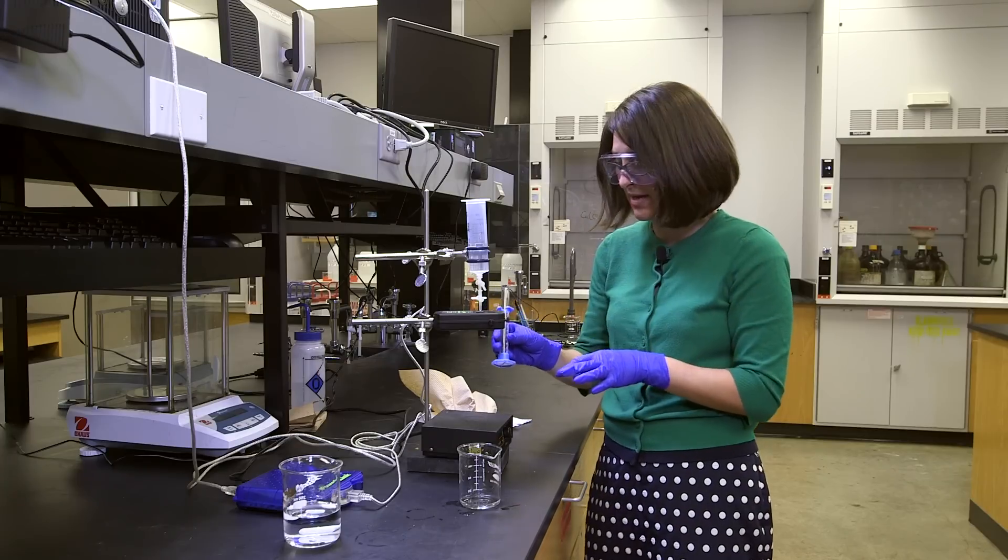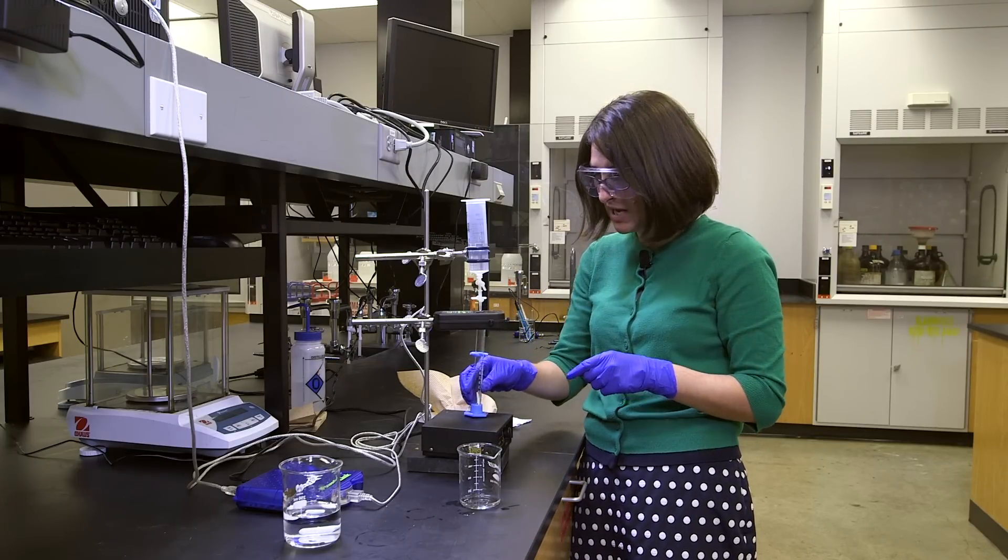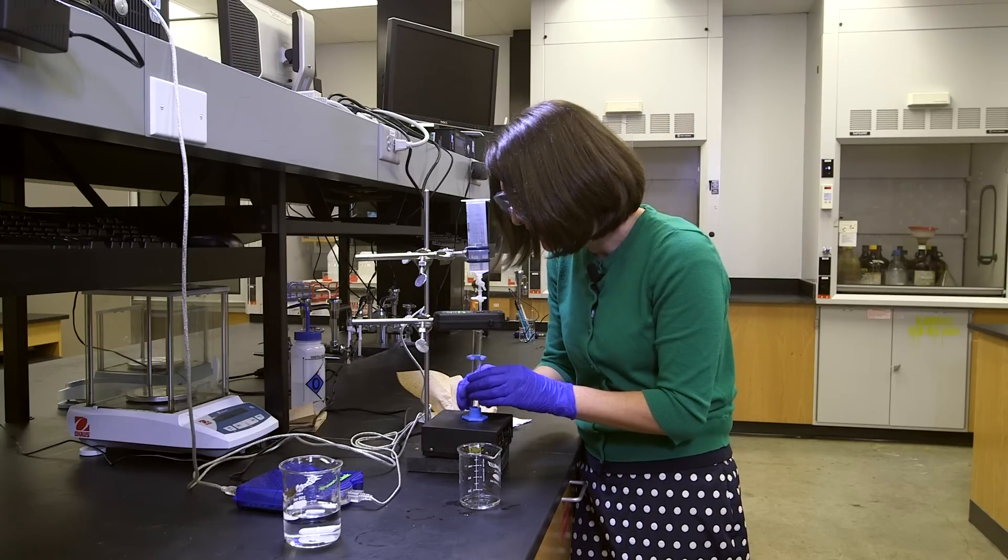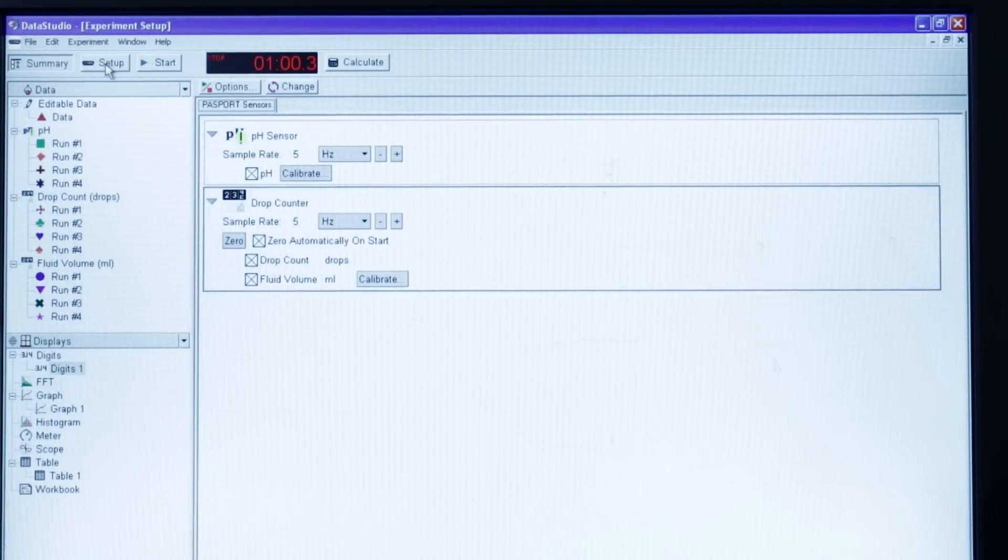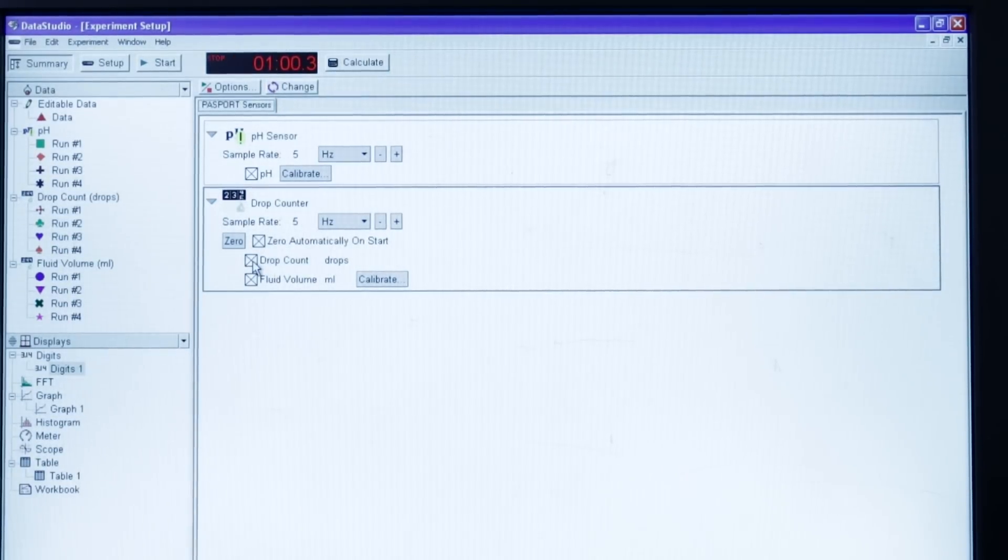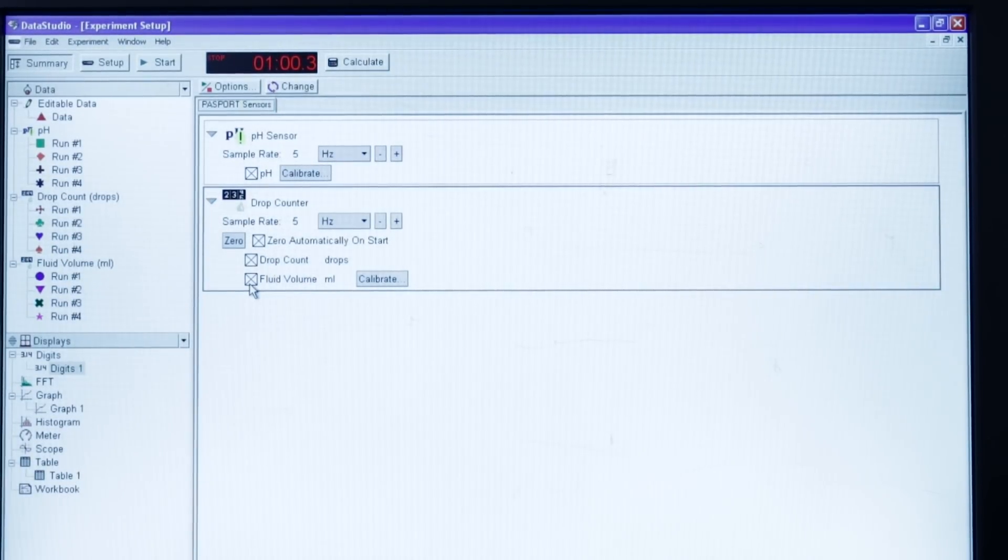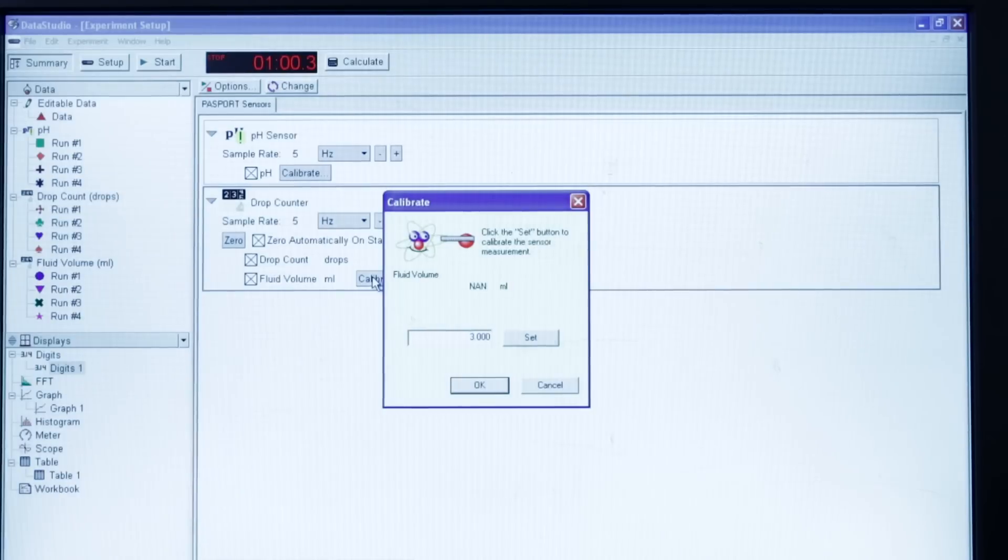All right, so now that I've set the drip rate, now I need to measure the volume and then I'll have to calibrate. I'll have to tell the computer what that volume was. So I'm going to go up to my setup, drop counter. I want to make sure that these boxes have X's, that it's going to zero automatically when I start. It's going to have a drop count. It will count the number of drops. And I'm going to tell it the fluid volume. So I'm going to click calibrate.